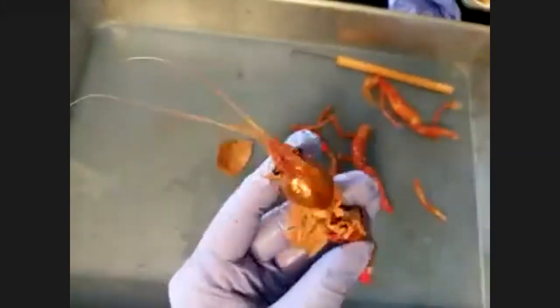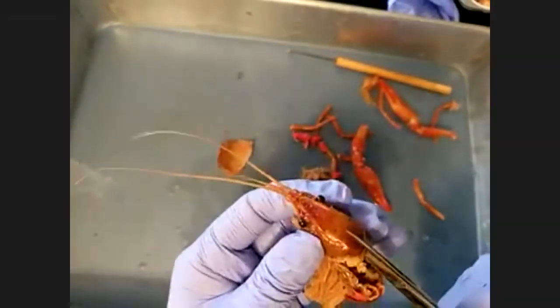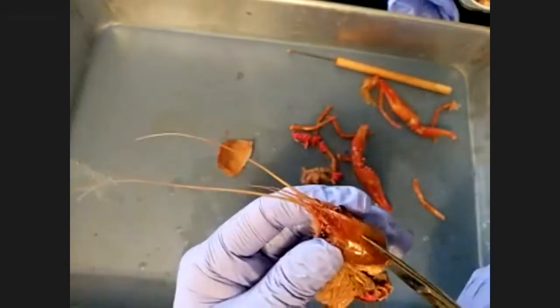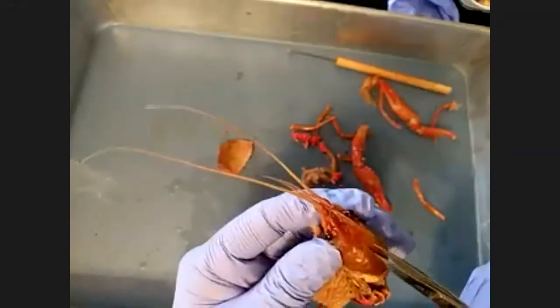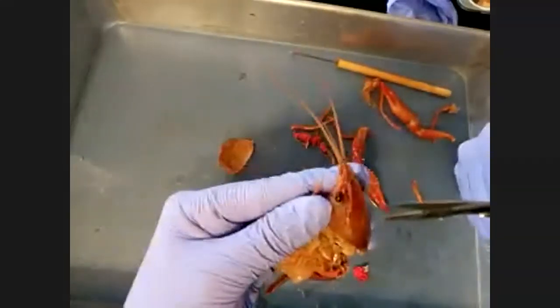Now I'm going to cut into the head, cutting straight down, because again, inside the head is where a bunch of really important stuff is. We want to see if we can look. Hopefully I didn't cut through it.